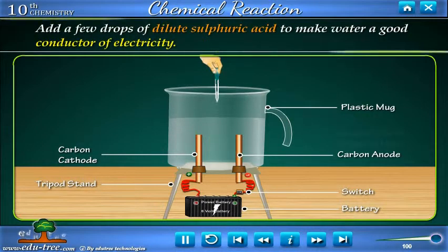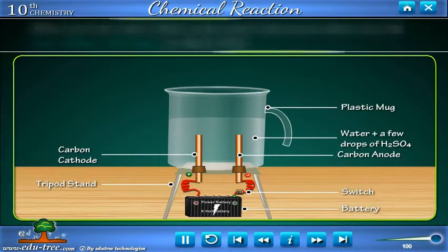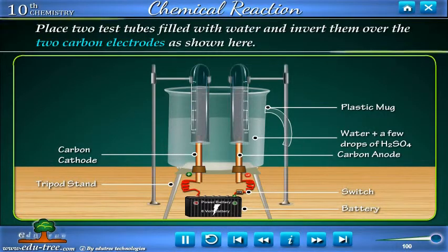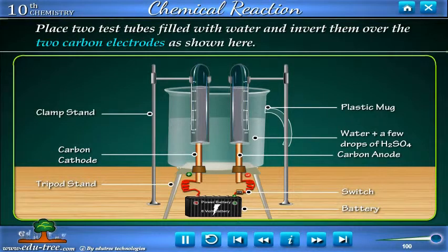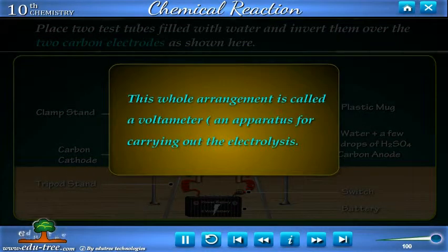Add a few drops of dilute sulphuric acid to make water a good conductor of electricity. Place two test tubes filled with water and invert them over the two carbon electrodes as shown here. This whole arrangement is called a voltameter — an apparatus for carrying out the electrolysis.